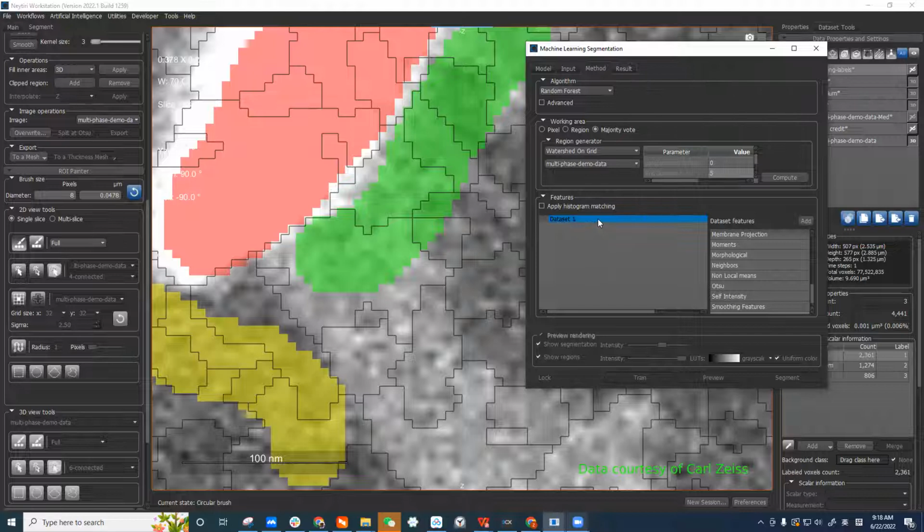For the dataset, for machine learning, we have to assign or choose the features. This is a major difference between machine learning and deep learning. For deep learning, you don't need to worry about what features to extract from the images. But for machine learning, you have to do it by yourself. Normally, we can do a few.